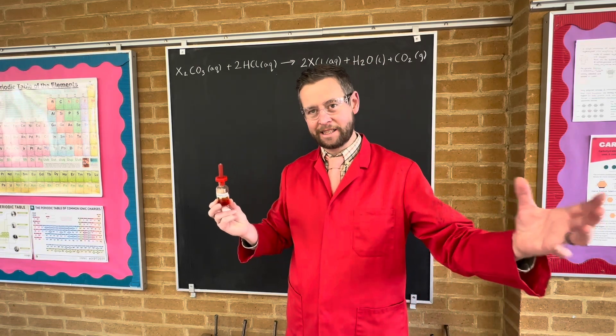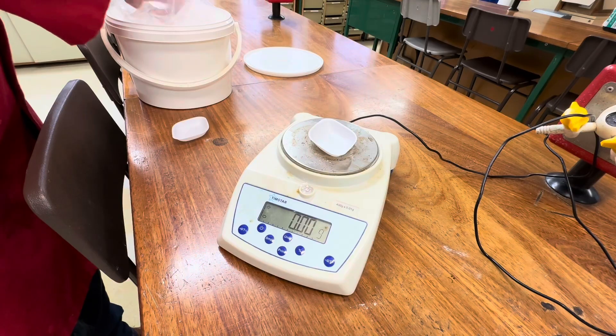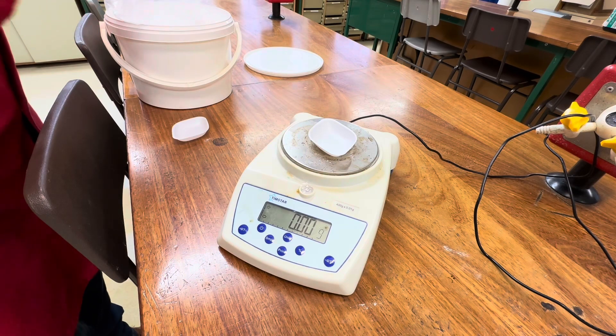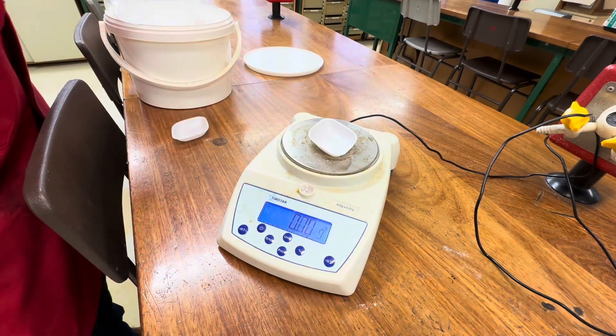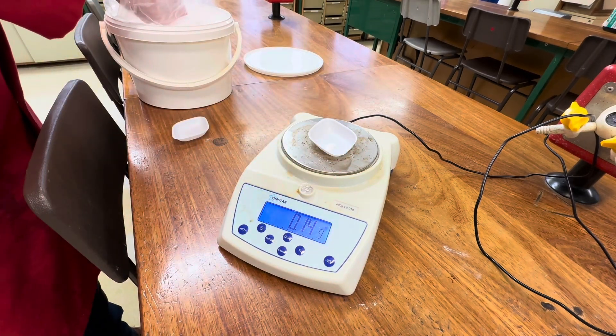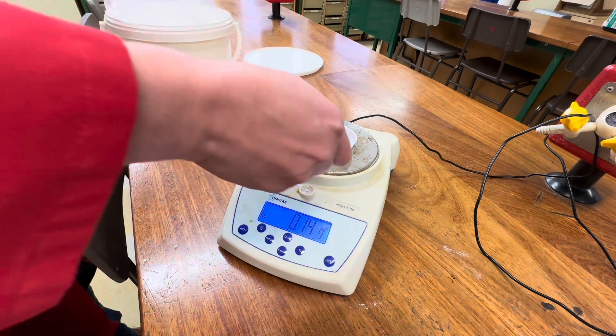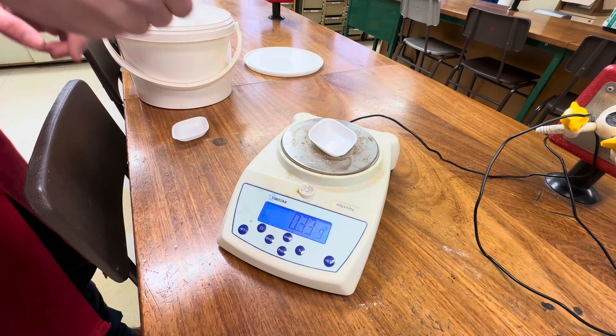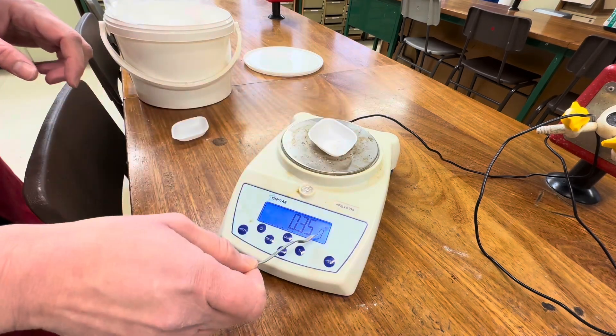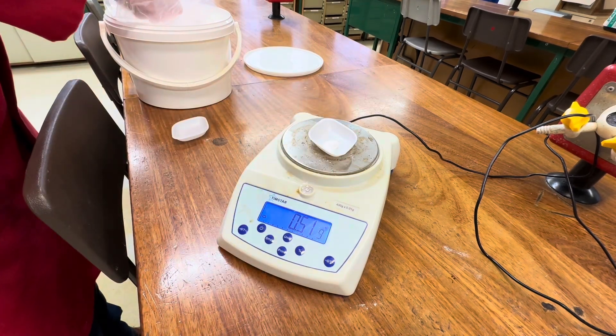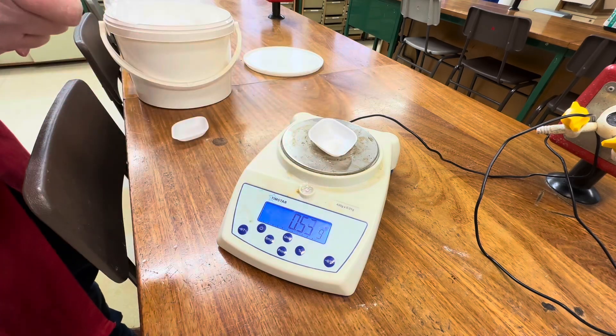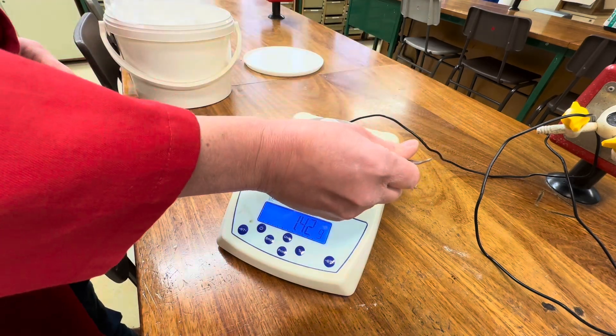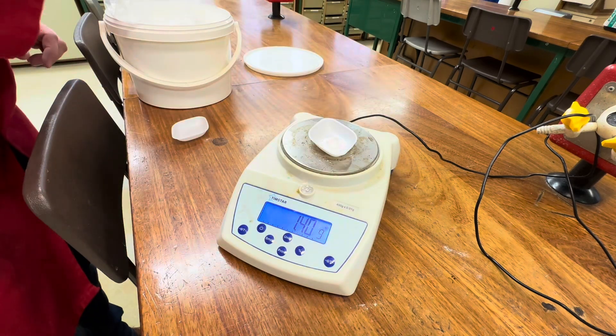The first thing we need to do is make up our standard solution. So first things first, we're going to measure about 1.4 grams. Making sure that the scales are in grams. Perfect.